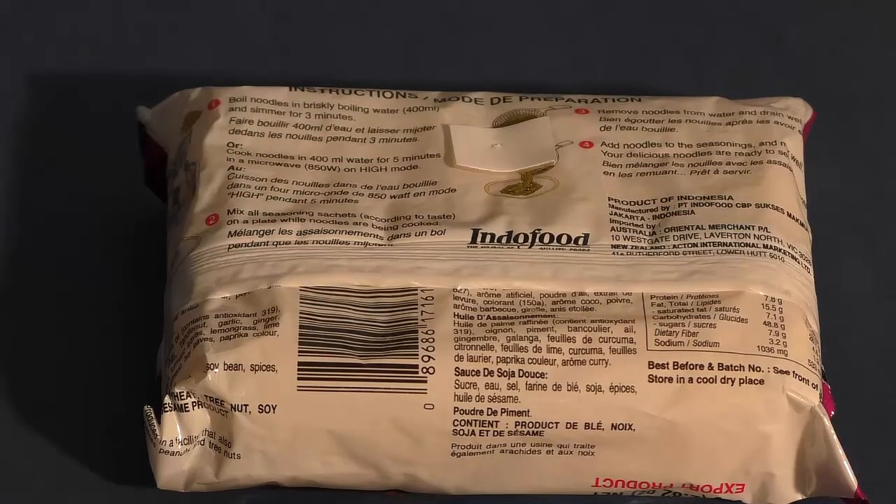You can reuse the same piece of septum tape about half a dozen to a dozen times before you need to replace it. Just use a different spot on the septum tape each time to stick the needle through.